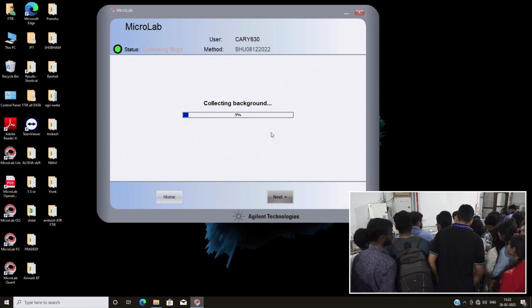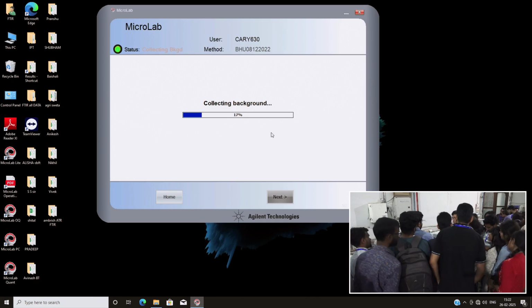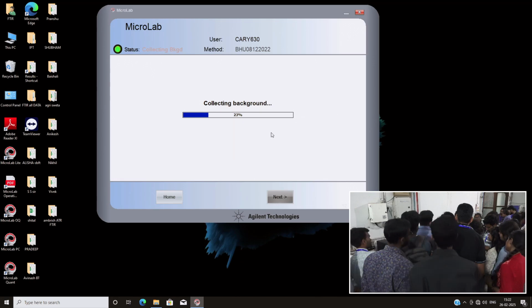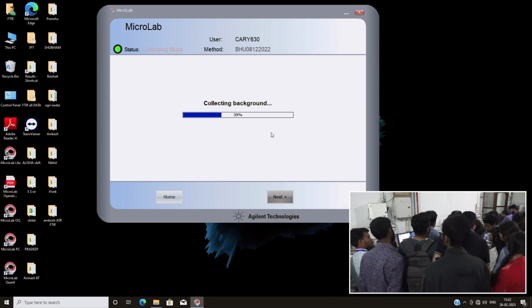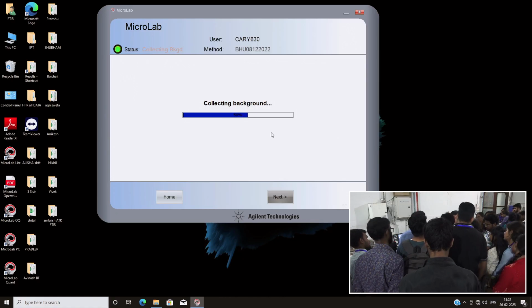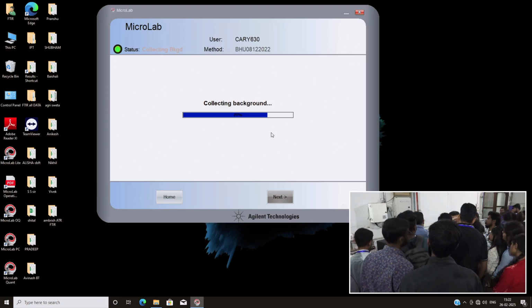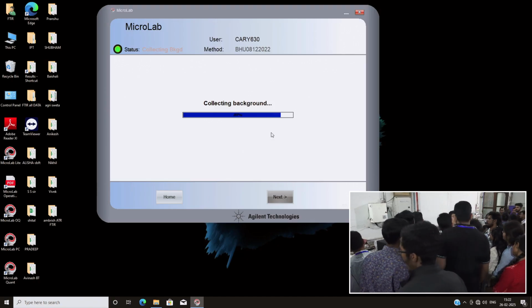So how do you decide the ideal concentration? All we can do is to explain that at this concentration the result is this, and you may check the concentration dependence and examine the possible effect of the concentration. If the peak shift occurs at a higher concentration but stops at some certain concentration, then below this concentration is safe to show. This is a representative spectrum of this solute.